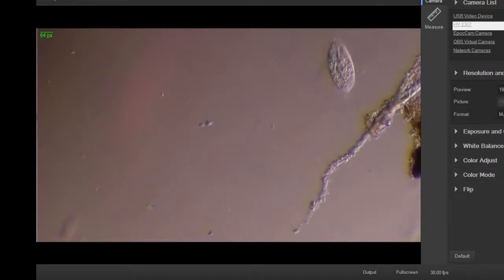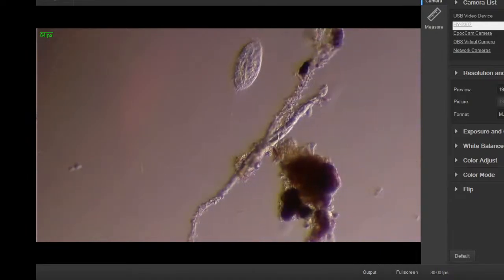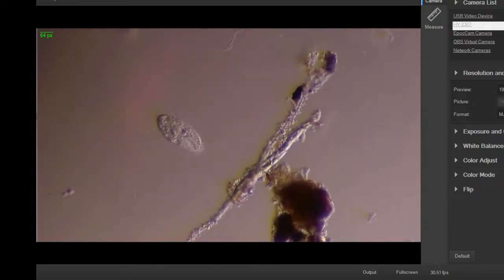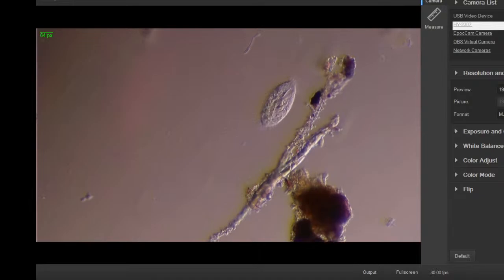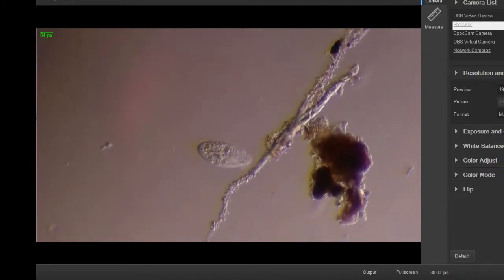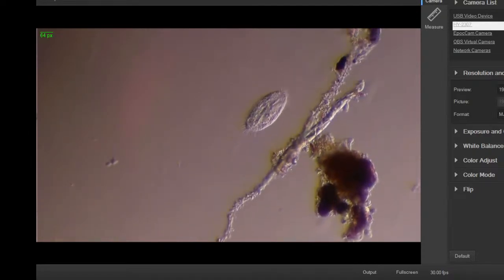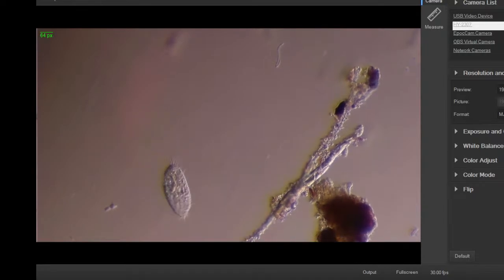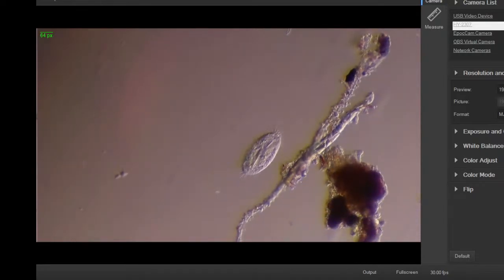But this one's doing a pretty good job. I mean, this guy looks really nice on this camera. You just have to tweak the lighting just right. Now he's on a little circuit. You get a lot of these guys on a hunting pattern, where they go in either a circle, or in this case, this guy almost does a rectangle or a square, with sharp turns and jerky movements. Let me just leave it here and let him do his little circuit.